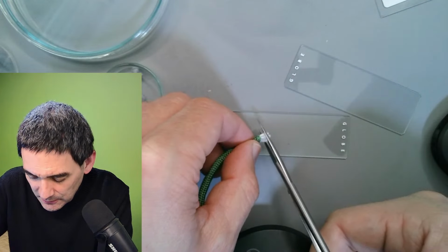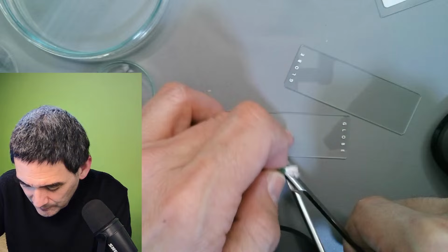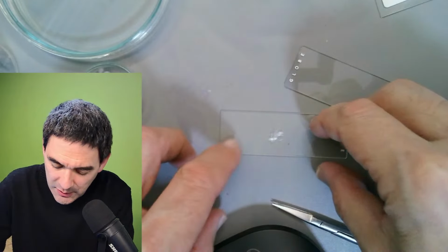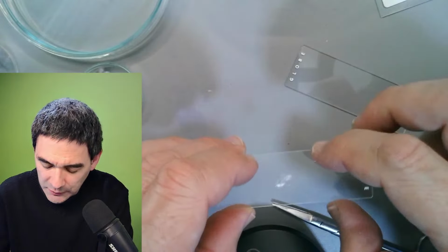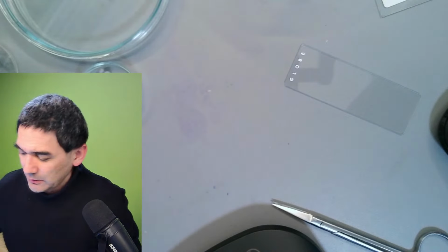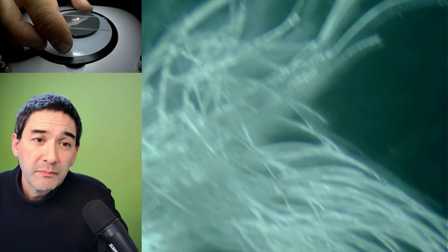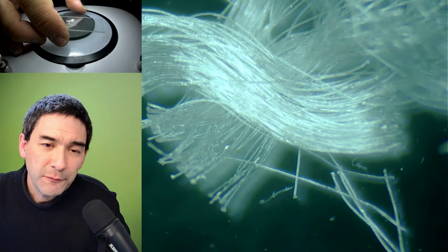So I'm going to take a little bit of this stuff and put it directly on here. Later on, maybe we can try to put a cover glass on it as well. And let's have a look. It's not flat now, but let's see how this works. Okay, it already looks a little bit different.